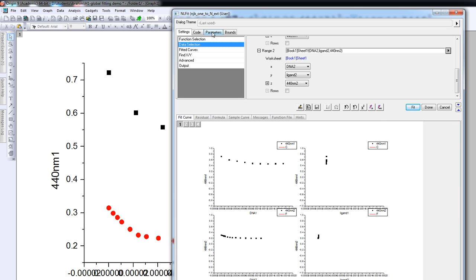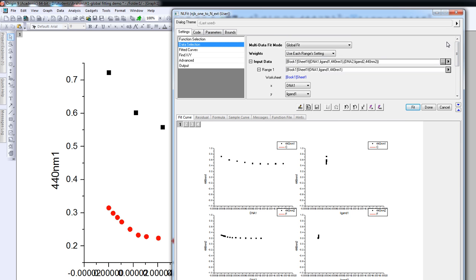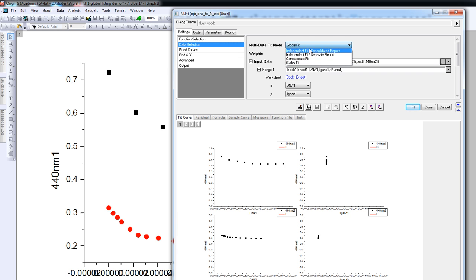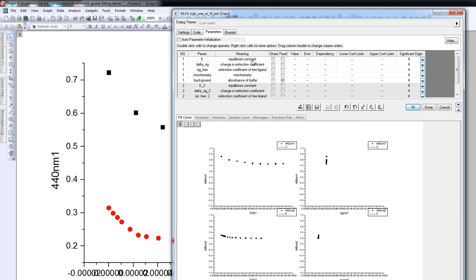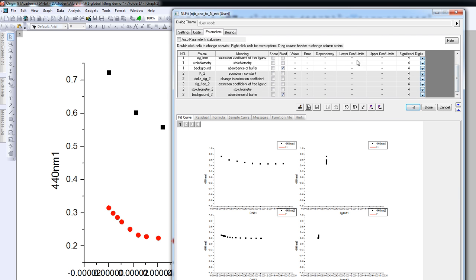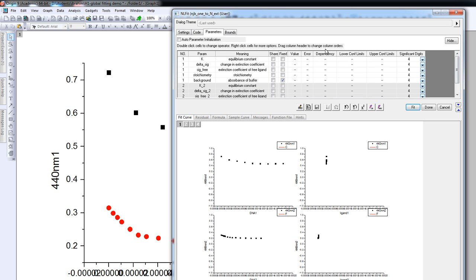If we now go back up, what we see is that we are going to carry out a global data fit. We could also do independent fits, but we want a global fit. If we go back to the parameters, we now see that there are more parameters in the model, and these models can also share parameters.